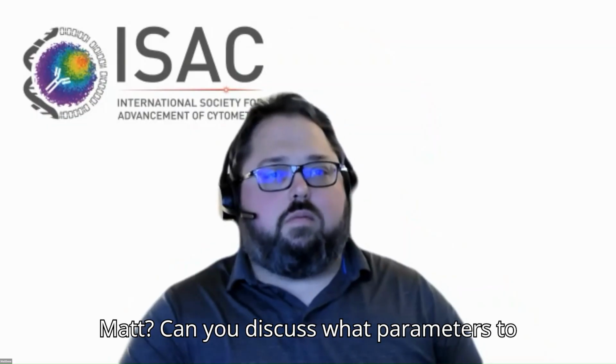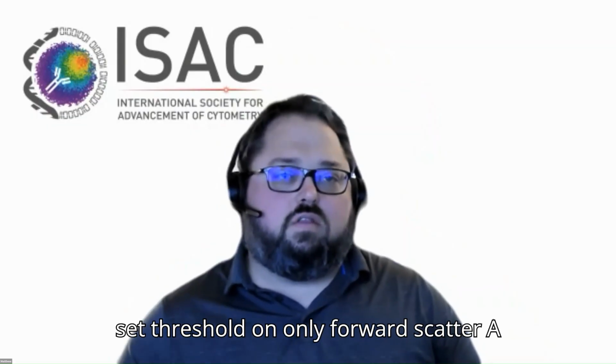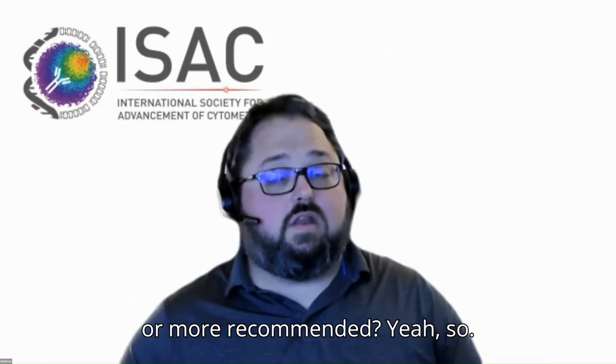Do you want to take this next question, Matt? Can you discuss what parameters to set threshold on, only forward scatter A or more recommended?